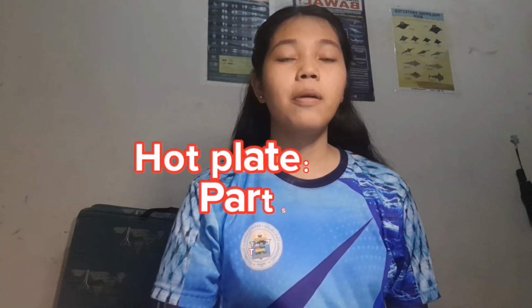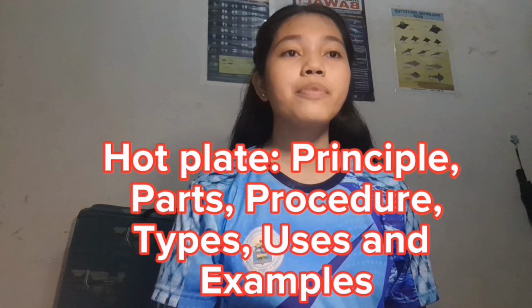Good day. Now we'll be discussing the hot plate: principle, parts, procedure, types, uses, and its example. So what is a hot plate? A hot plate is a laboratory device used to heat sample solutions and materials uniformly at precise temperatures, without the danger associated with an open flame. In microbiology laboratories, the hot plate serves its purpose in making agar media and biochemical media.